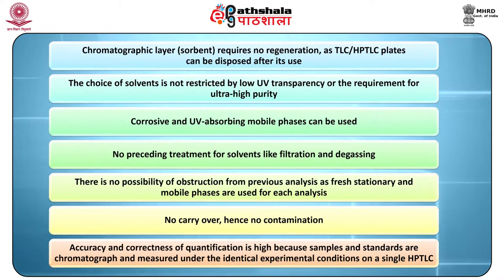and there is availability of a wide range of stationary phases with selectivity for mixture components. The chromatographic layer sorbent requires no regeneration, as HPTLC plates can be disposed of after use. The choice of solvents is not restricted by low UV transparency or by the requirement for ultra high purity. Corrosive and UV absorbing mobile phases can be used. There is no preceding treatment for these solvents, like filtration and degassing.